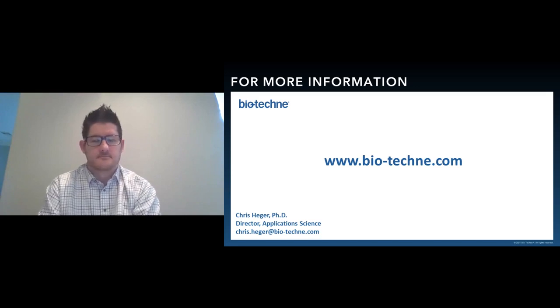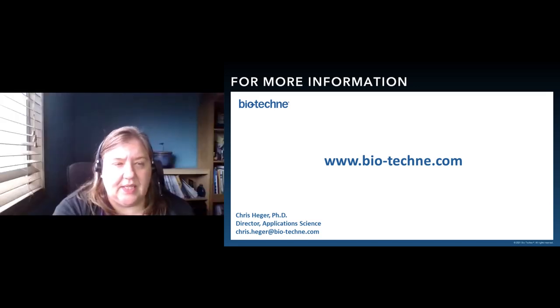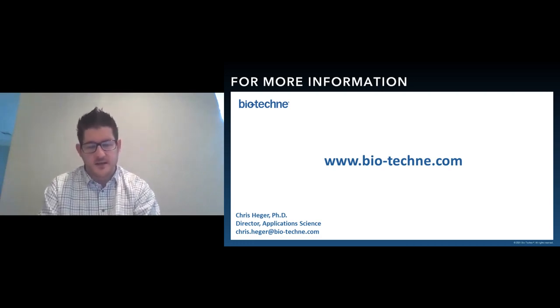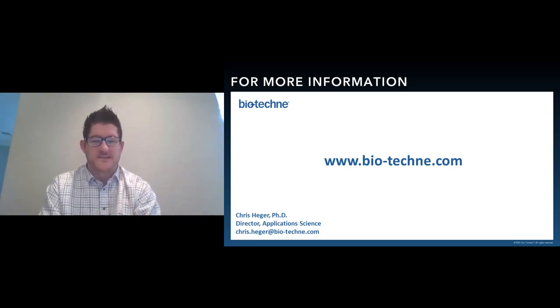Okay. For the Simple Western systems, can you comment on how the multiplexing is done? Is it like strip and reprobing? So you can multiplex on Simple Western through a variety of approaches. Certainly, you could put the two primary antibodies together and just go straight at it. We do have the replex, which is like strip and reprobe, with nearly 100% efficiency of removal in between. So you do have that option. We also, on a JEST, you can multiplex between colors or between chemiluminescence and fluorescence. You can also multiplex an immunoassay and a total protein assay, just to finish out the menu there.